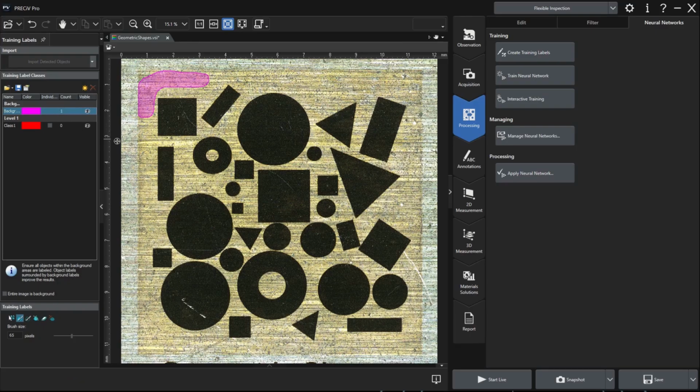You can start to draw another background area object, and the number of areas or background objects that you have created is displayed in the count field. If you draw overlapping areas, they will truncate each other into mutually exclusive areas. The third area I tried to draw was truncated into two resulting areas by the already existing second area. That is why you can see 4 objects in the count field now. One of them is probably so small that we cannot see it at this zoom level.